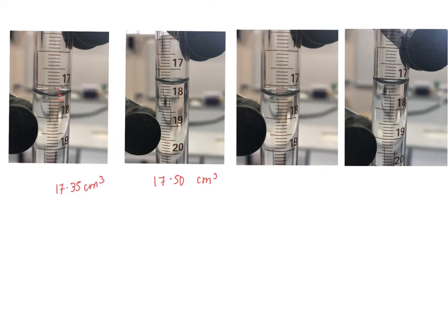So this one here, number 3, the meniscus is there, and this starts at 17.0, 17.1, 17.2, 17.3, 17.4. So again, this is between 17.3 and 17.4. So this one is also 17.35 centimeters cubed. And for the last one, the meniscus, the bottom of the curve is just here. This is 17.0, 17.1, 17.2. So the meniscus is between 17.1 and 17.2. So the burette reading here is 17.15 centimeters cubed.